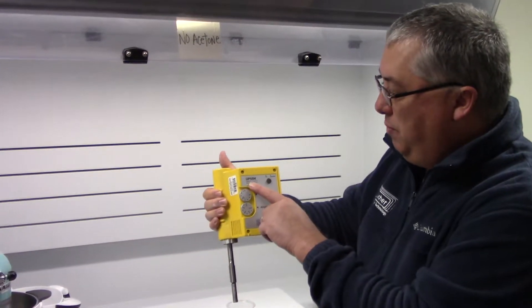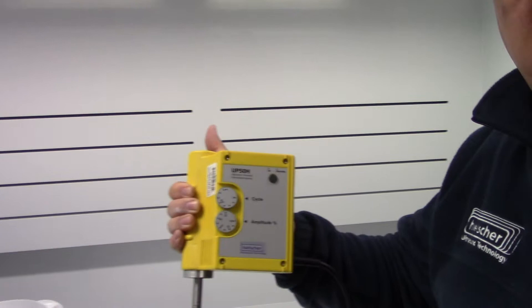Hi, this is Michael, and today we're looking at the UP50H manufactured by Hilscher Ultrasonics.